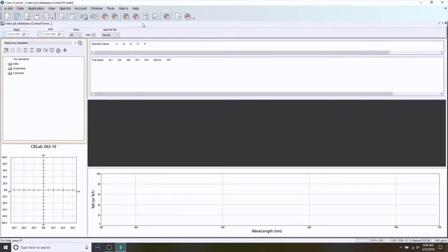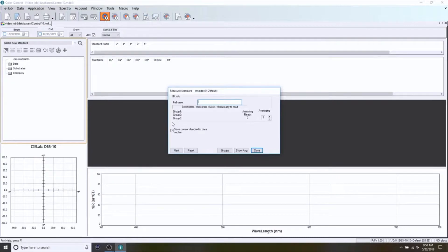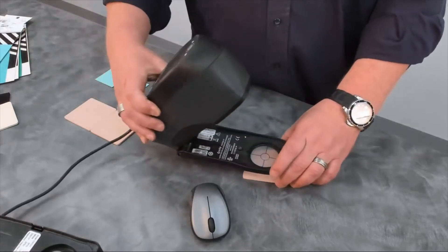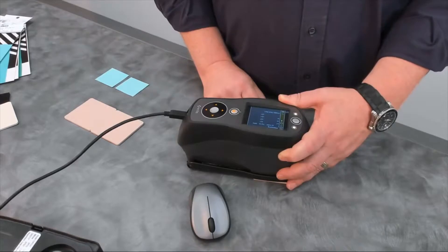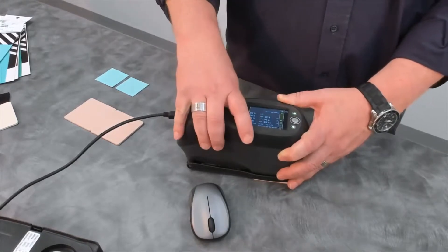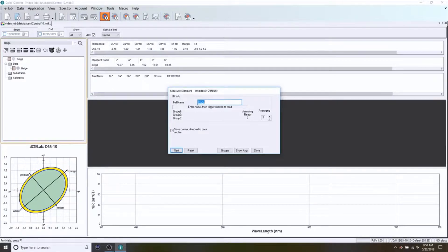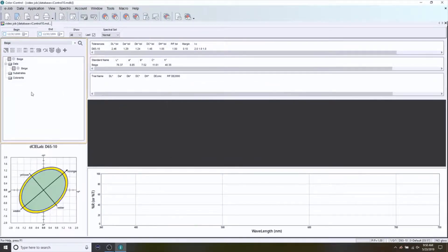To create a standard, I'm going to go to the icon up here — it looks like a target or a standard in our case. I'm going to click on that and it's going to open a dialog box for me to enter the name of the standard. I'm going to keep it simple and call it by its name, in this case it's Beige. I'll click Next and you'll see it says 'Waiting Untriggered Read,' telling me the software is waiting for me to take the instrument — my CI64 in this case — press down, and it completes the measurement. Now I can close that window and you'll see that I have a color standard created.